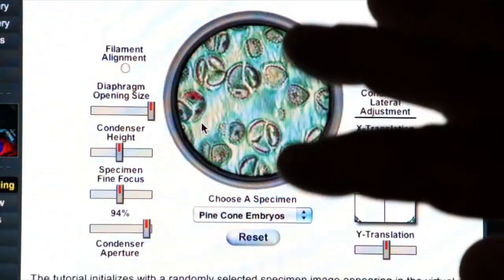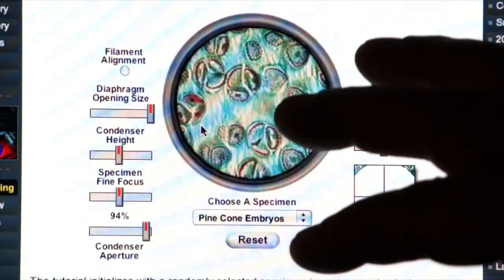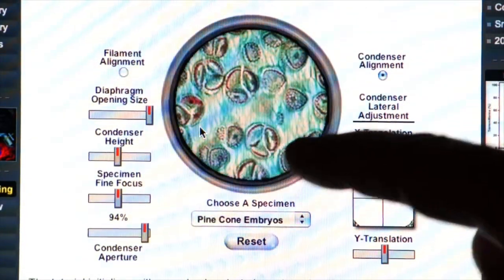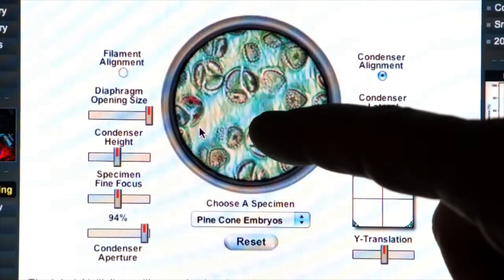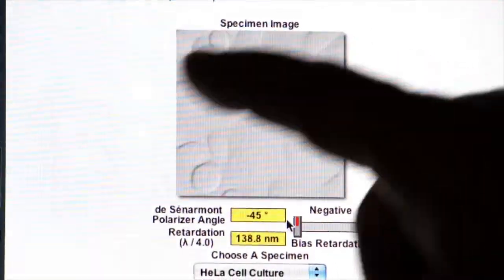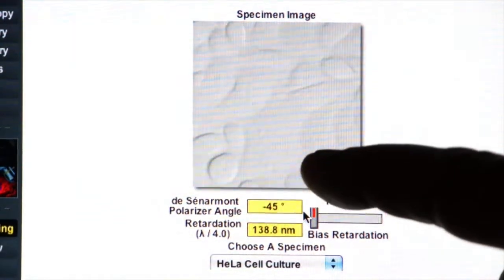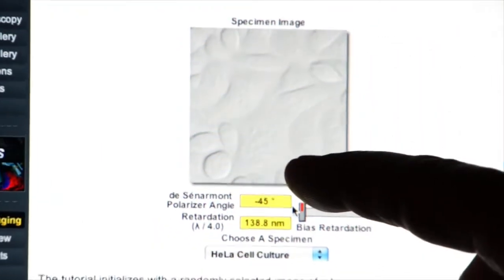There are three modes of illumination that we use for transmitted light in the Leica confocal microscope. The first one is bright field, as you see here. It's simply light passing through your specimen, which in this case is stained. If you're looking at live cells which have been cultured and you look at them in bright field, they might look something like this. Bright field is not the preferred transmitted light technique for looking at living cells.